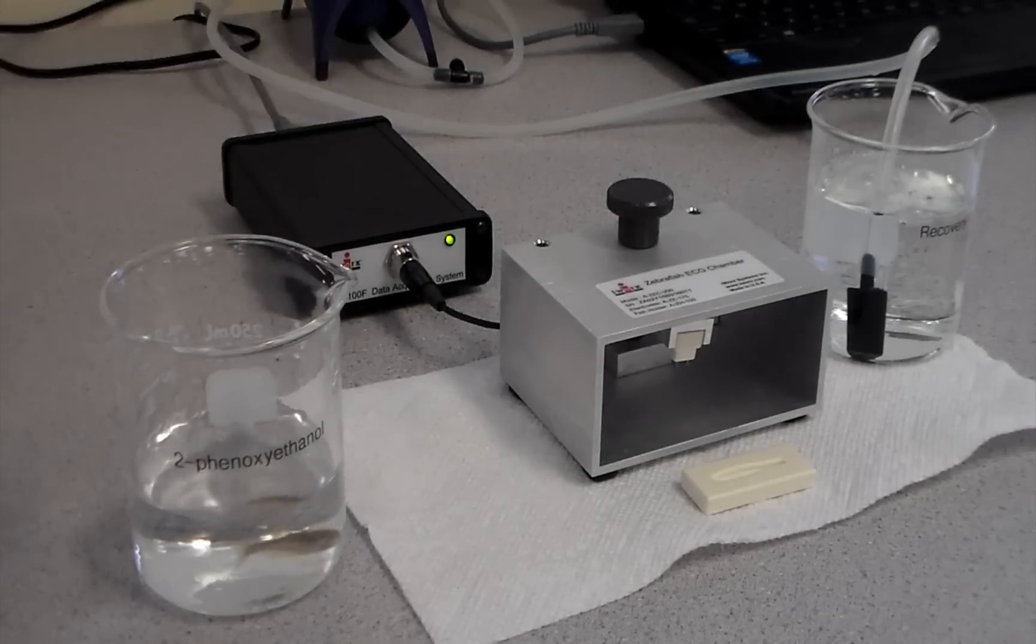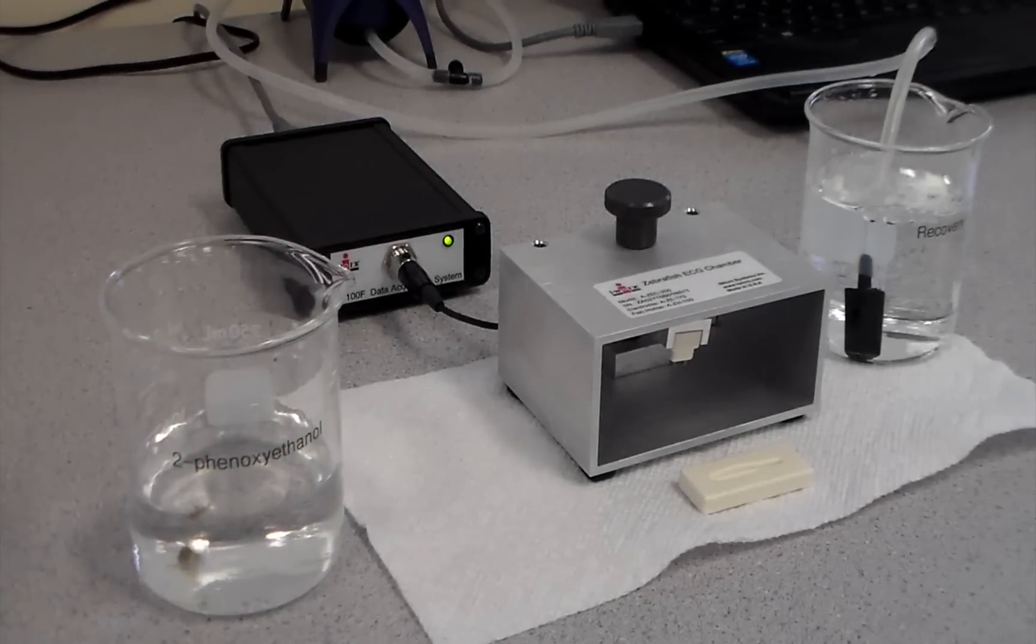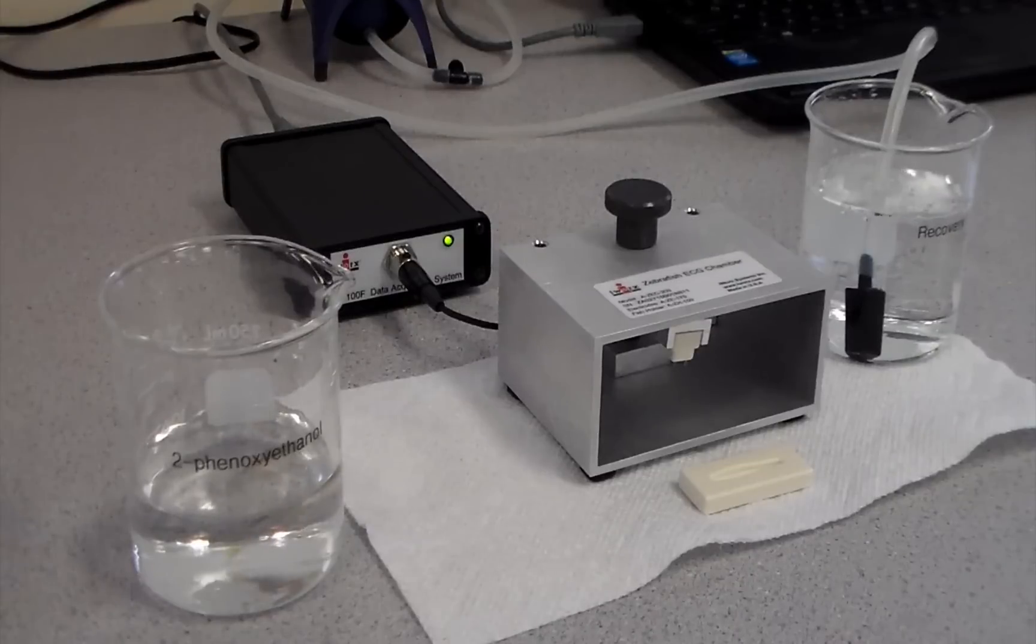For recording ECG, the zebrafish is placed in a 2-phenoxyethanol anesthetizing solution, which is a 1 to 1000 dilution, for approximately 3 minutes until there is minimal gill motion.